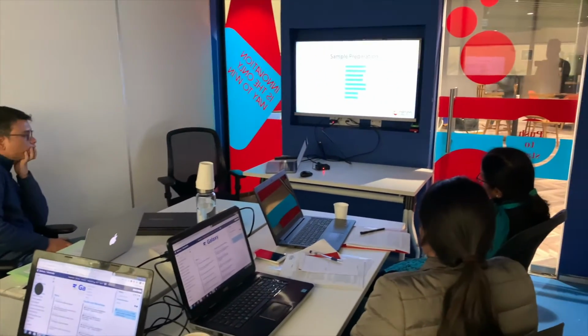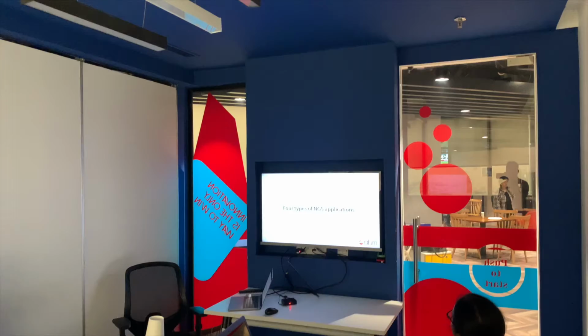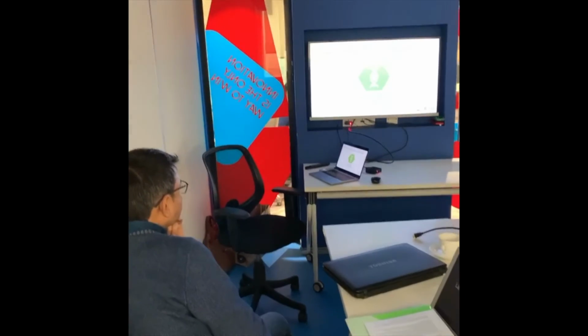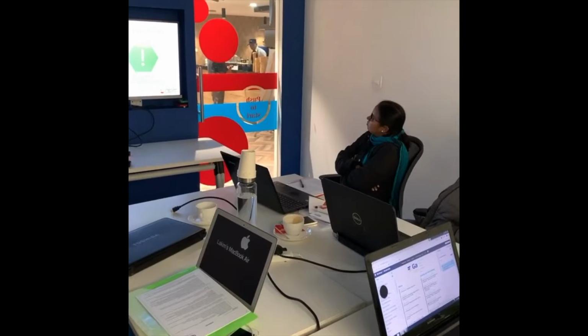representing the sample input. However, depending on the type of NGS application, different library preparation steps are taken. There are 4 types of NGS applications which are considered below: whole genome sequencing, exome sequencing, and others. The library preparation kit is ideal for any genome where there is 1 to 2 micrograms of genomic DNA available. The purpose of this kit is to avoid PCR amplification errors over long distances.